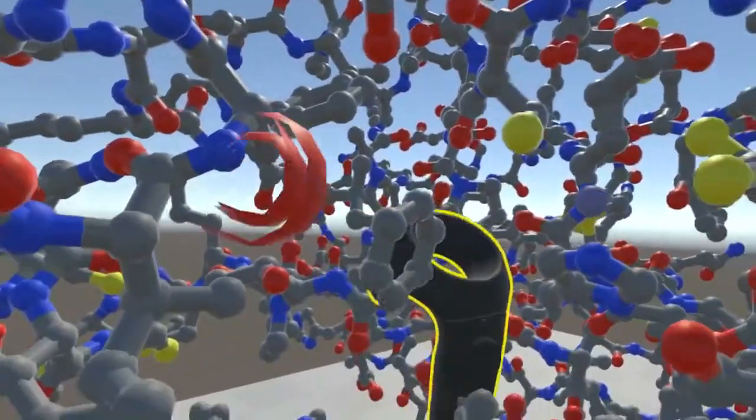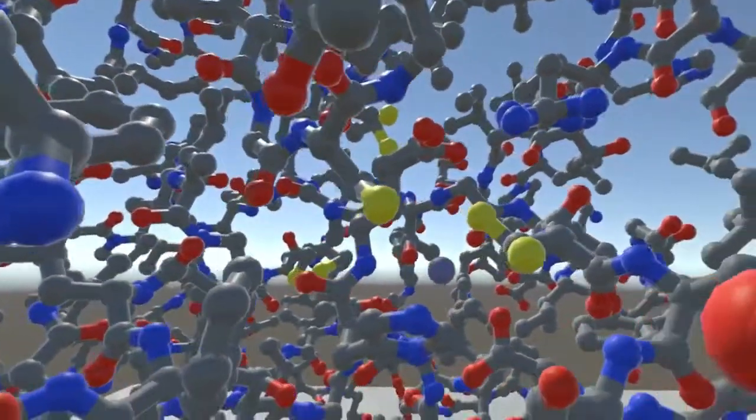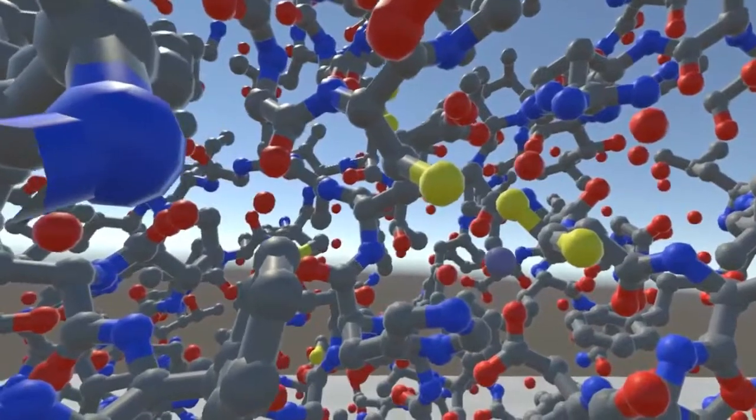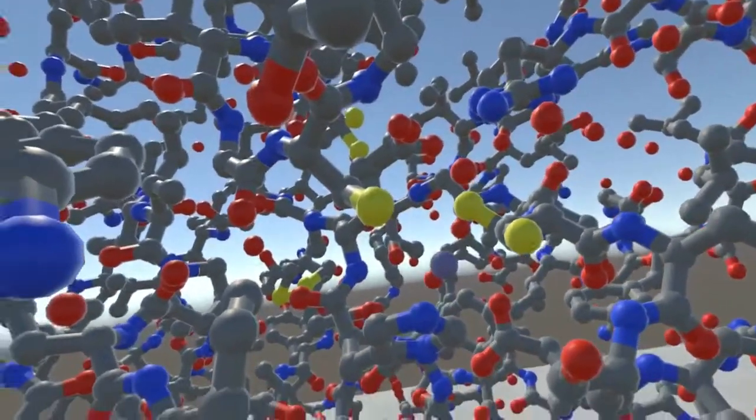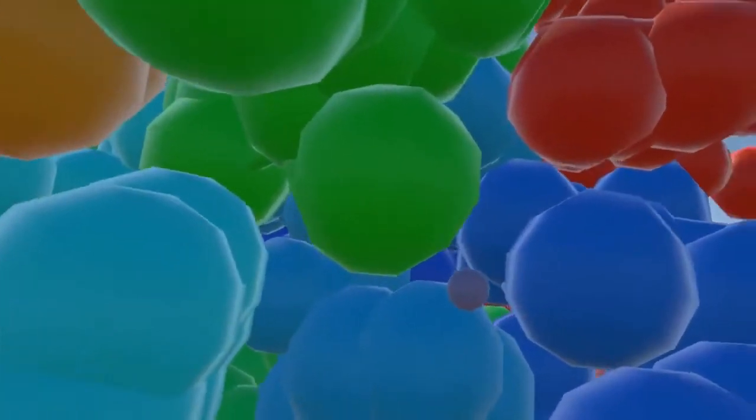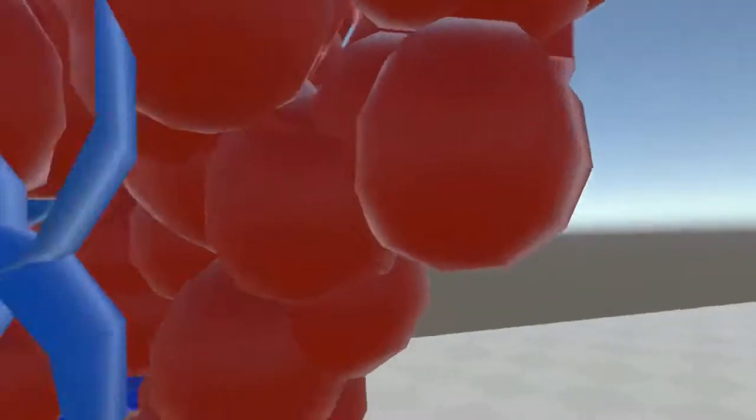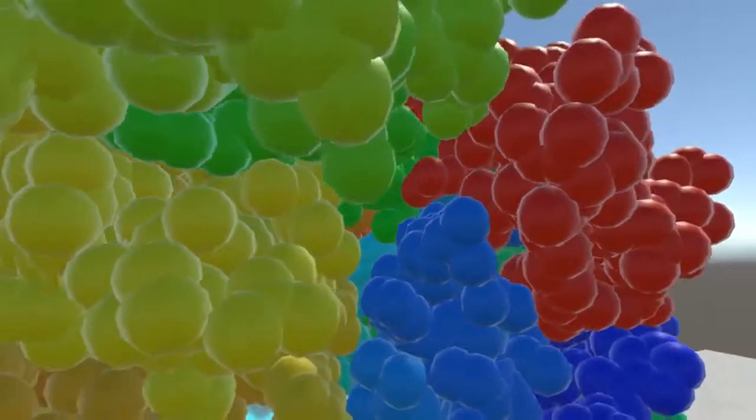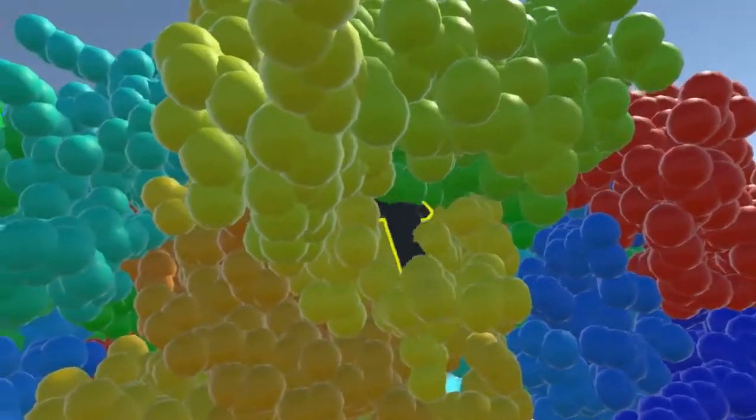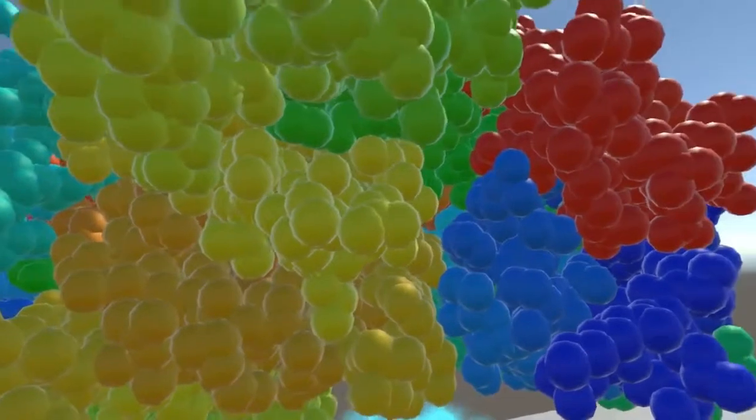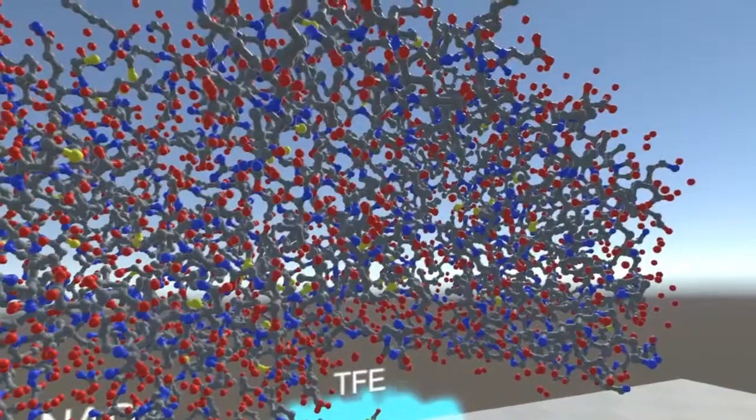But believe me, the structure is at a very low electron density right now. If we switch on the full electron density for that molecule, it looks like there's hardly any space at all. Now you're looking at the structure from the outside. But still, you can go in and use the structure for doing something. Also, this would be completely impossible without using VR.